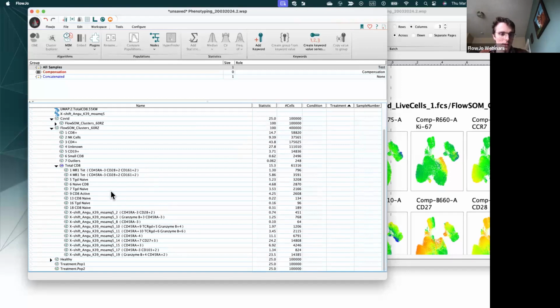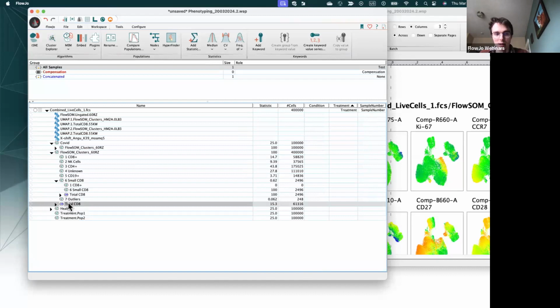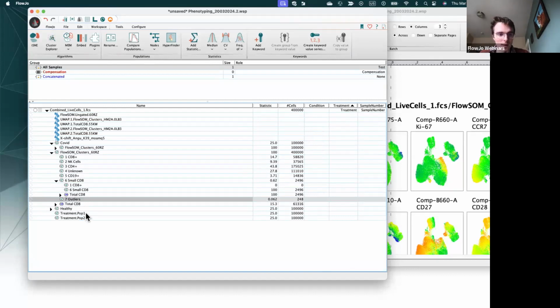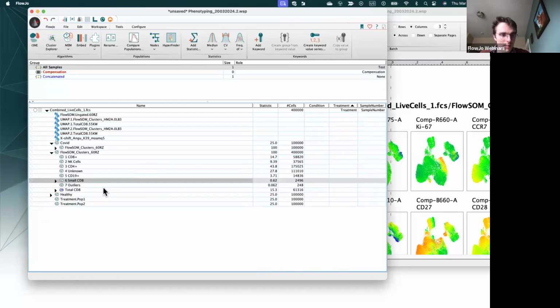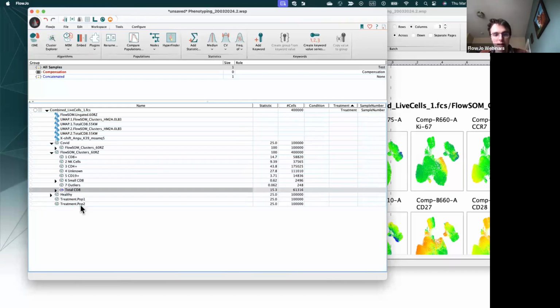Okay, well, let's give up on Cluster Explorer. You can use it to compare different conditions. You can use T-Rex as well, and that's actually what I would suggest using. I just did something here. Oh, don't know what I did. I think I copied it. Well, so yeah, that's some of the ways I'd look at the different conditions.